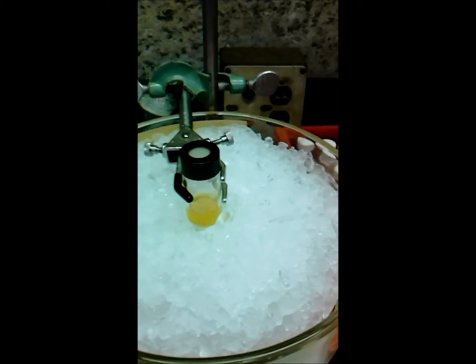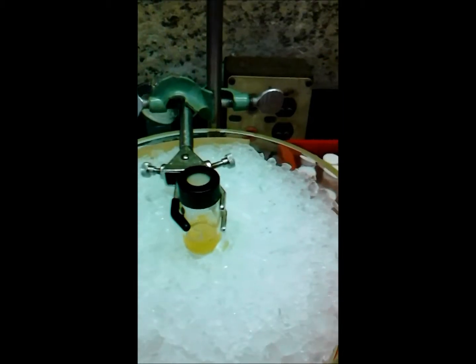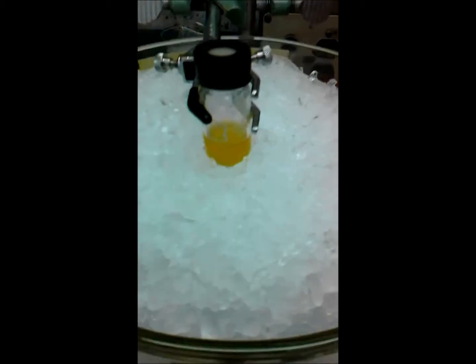I'd like to be doing this under nitrogen, but I don't have a Schlenk line set up right now, nor do I even have a balloon. So we'll make do with what we have. See, it looks like a solid almost precipitated out. We'll see. Alright, after the second addition of 200 microliters, definitely starting to get some solids, which you can maybe see in there.